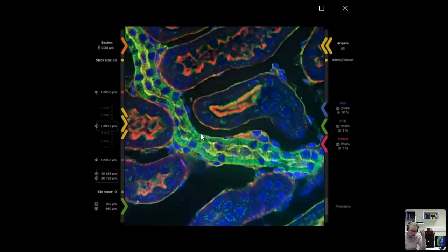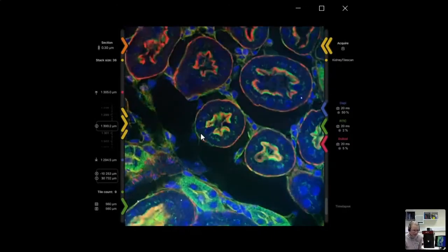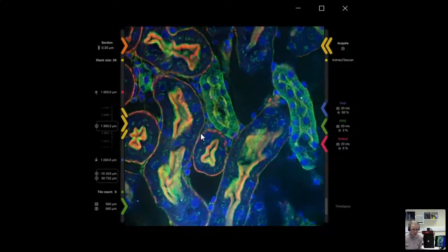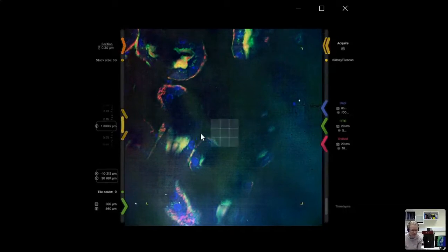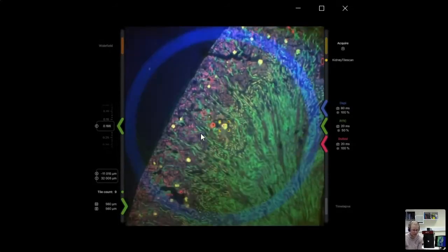So that's a brief run-through of how to do a Z-stack and a tile scan in Unity. On the bottom right of the graphical user interface is also a time-lapse option. We can set a time interval and duration to do time-lapse imaging as well. It really does everything you'd want your traditional spinning-disk confocal to do, with very similar resolution to a traditional laser-based confocal, but in a much more compact and easy-to-use format. Then you can come back into overview mode to find a new region of interest and go again.